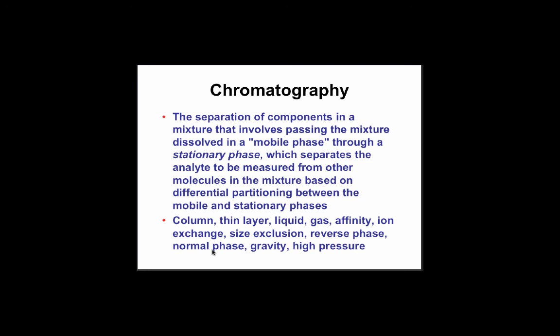The stationary phases can perform their separation through affinity, so through recognition, perhaps by antibodies or chemical recognition, through ions and ion exchange, attraction of positive and negative ions, through sizing, small molecules moving faster or slower than big molecules, again, depending on the type of separation. You can separate on hydrophobicity, which is called reverse phase, and you can speed up or slow down the separation. So if you just let separation happen through gravity or through electric fields, or you can speed it up by adding higher pressures.